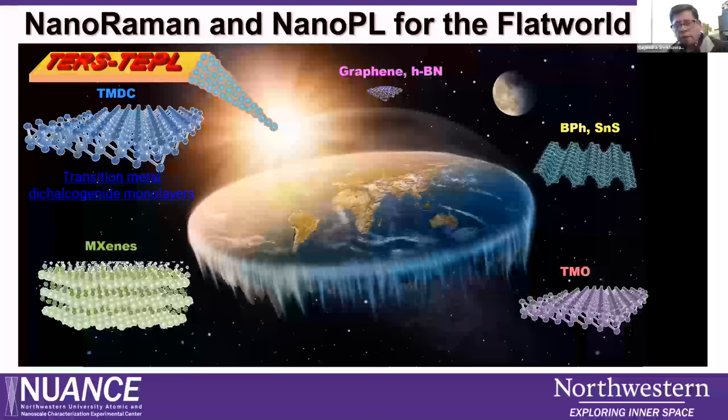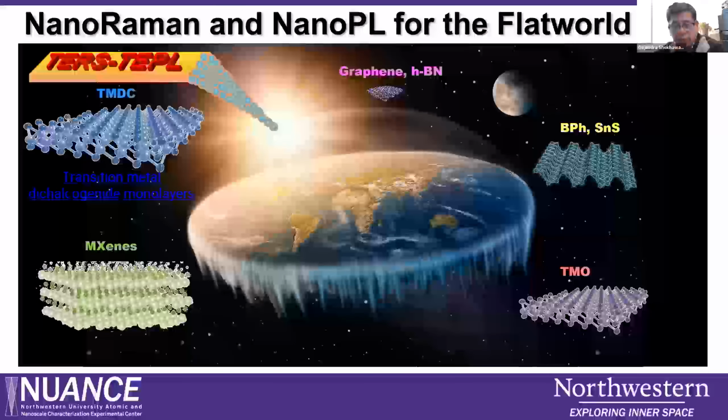So for the area where the sample is a limitation, we are trying to acquire a nano IR imaging system. That's pretty similar to TERS, but there you measure the absorption spectroscopy. Here you are collecting the inelastic scattered light in far field optics. The nano IR is not limited by any sample prep and all those things. So that technique will be here, maybe sometime this year. We are working towards that.